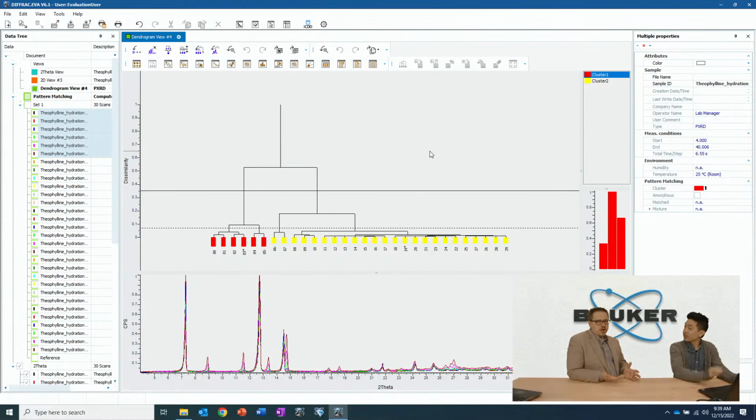You can actually do hundreds. Where I found this very useful as a tool is when you start looking at HTS, in the pharmaceutical industry, where people have gone well beyond the 96 well plate. Now they go to 300 and some. Here you can bring that data in and right there see, okay, these ones are related to each other, and this is how they're related. We'll get back to that. I've got some cool stuff to show.